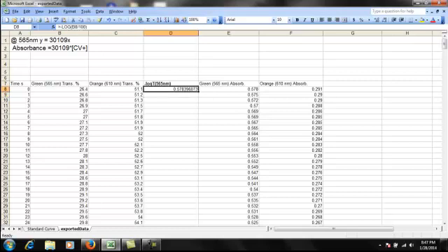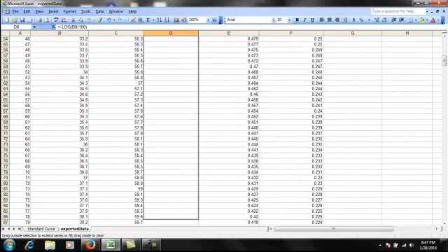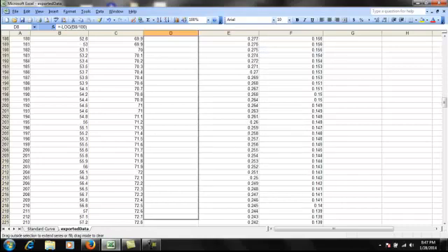If you take a look here at this box, how this is highlighted, you see here in the corner how there's that dark little square. If I highlight that, see how that turns into a crosshair? I can left click on this, and then I can drag that down. And this is a command that is known as fill down. What it's going to do is copy that formula into each of these cells that I am now highlighting, and that's going to tell it to take the negative log of the corresponding data point in the cell a few columns over.